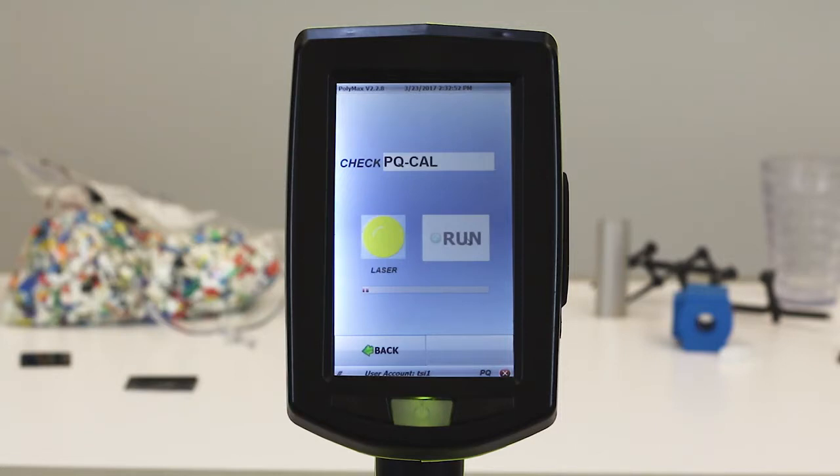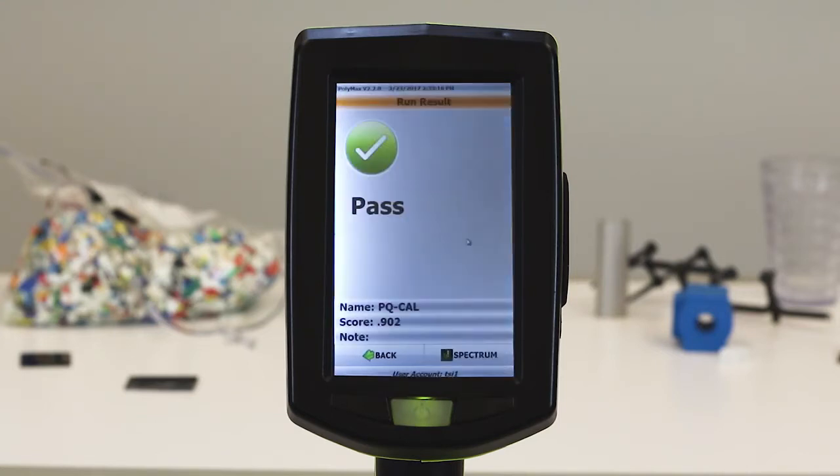During this process, the Polymax acquires the spectrum of a provided calibration sample and compares it to the existing standard spectrum of the PQ-Cal in the library. When it has been completed, you will receive a pass or fail indicator. If the system fails the PQ-Cal, make sure the calibration toggle is in the correct position and try again.